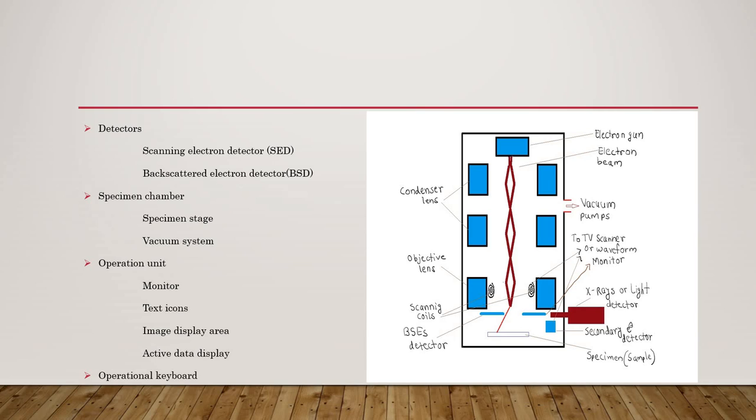Active data display. The current setting of the same is displayed here. By clicking each item, the dialog box will appear so that adjustment can be made.